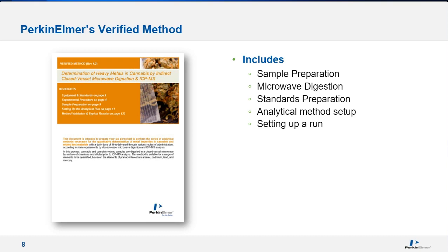Again, this was primarily focused on the big four heavy metals, so there are minor modifications such as different standards to be used to analyze the complete list of elements.